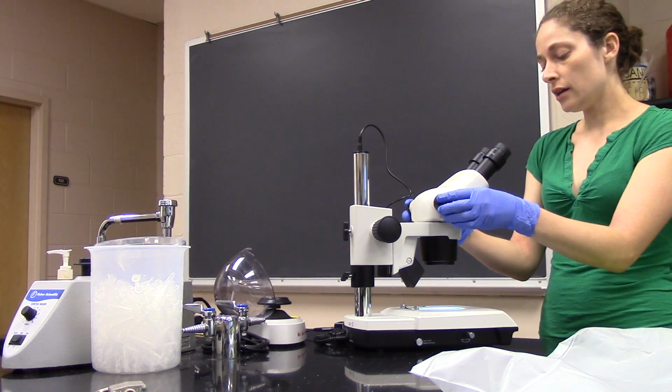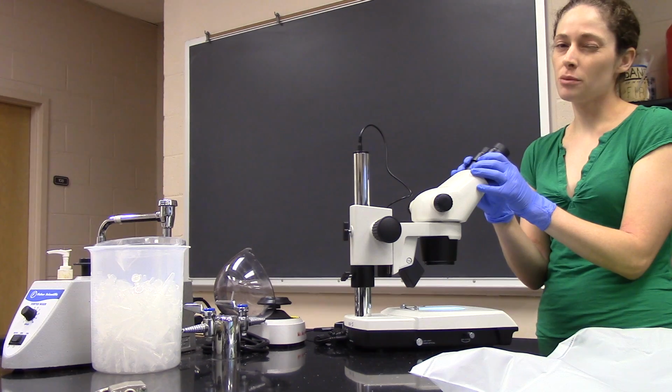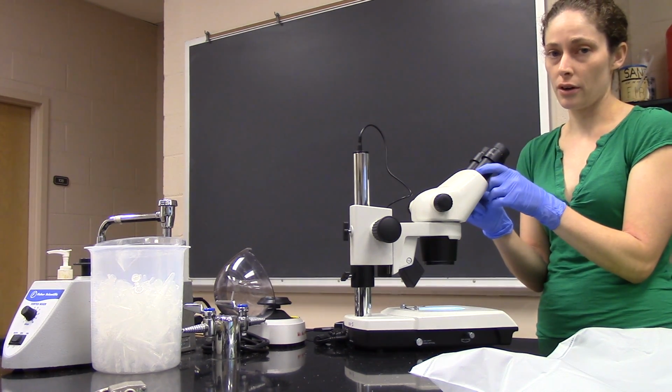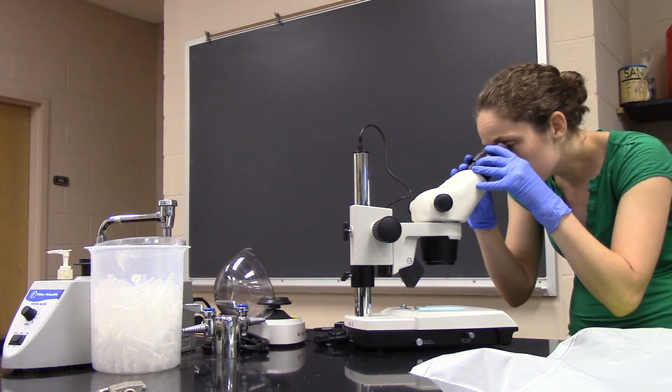Okay, so before you get started, you want to adjust the distance between the eyepieces. If you're one of those people that closes one eye and just uses one eye to look through a microscope, this is most likely where you're going wrong. So take a bit of time to look through and comfortably set these for your eye width.